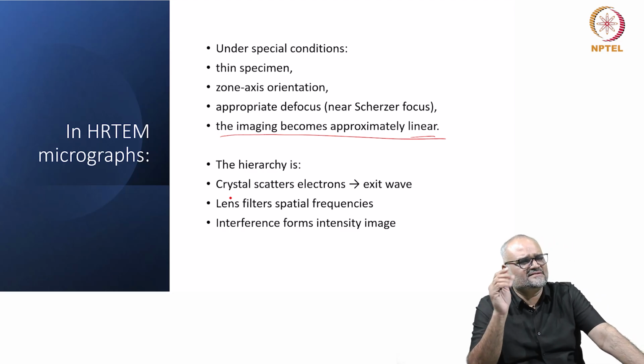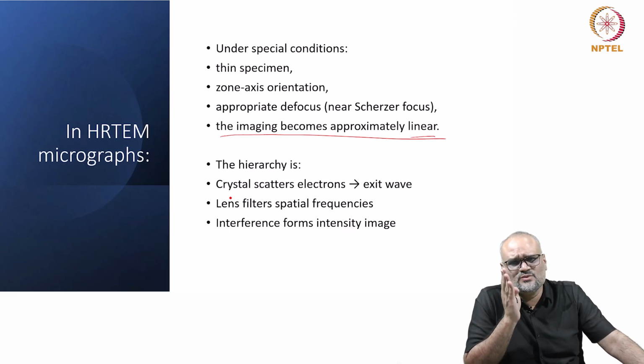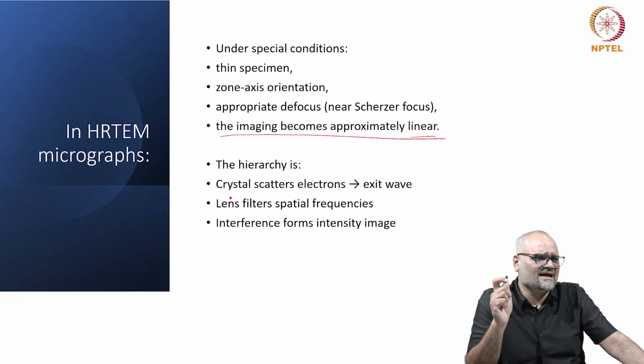So HREM micrographs should always be interpreted through the imaging theory and not just visually. If I see a dot in an HREM micrograph, do not think that this is actually the position of an atom physically within the crystalline lattice.